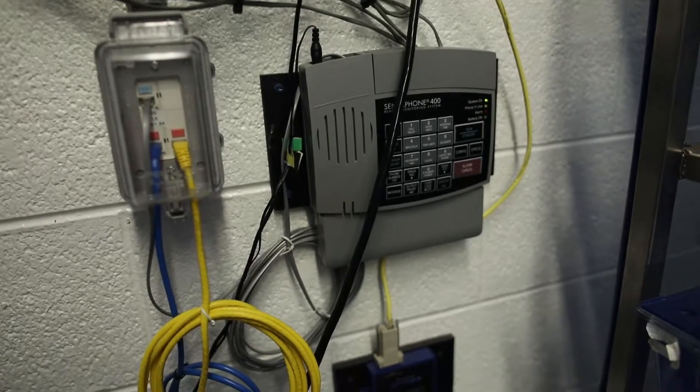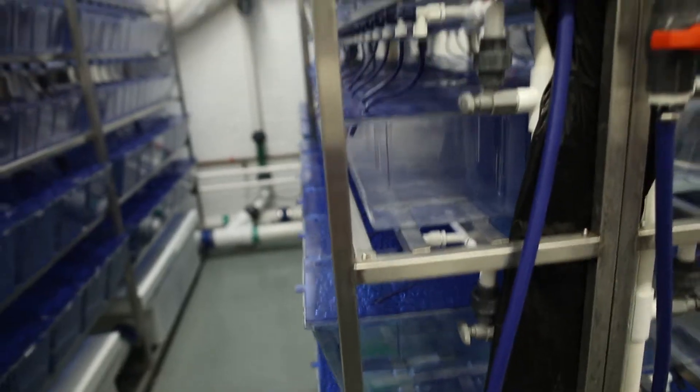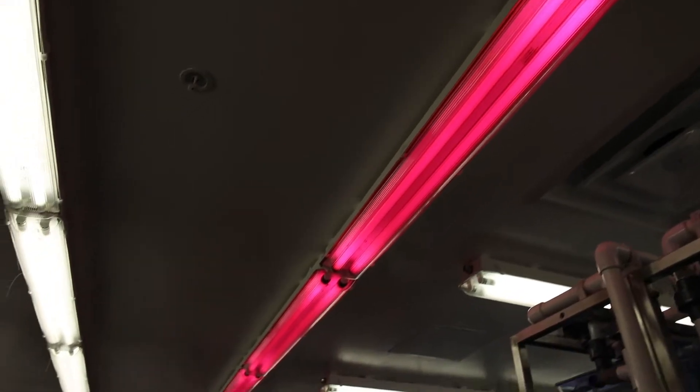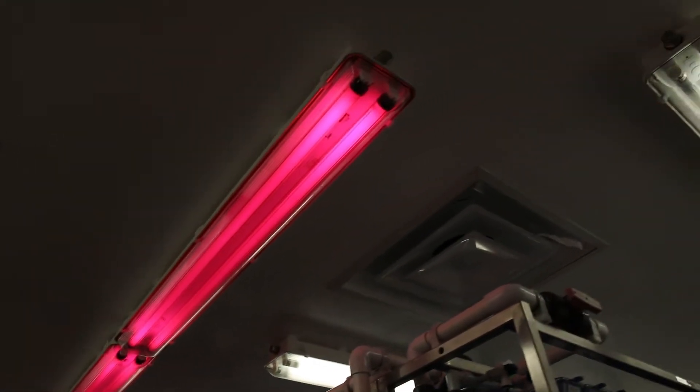Additionally, the facility has one sensor phone auto-dialer which verifies all electric connections. Each system has its own water so that in case of disease, only one system is affected. The lighting system is a ceiling light with one red light for working at night or in emergency cases.